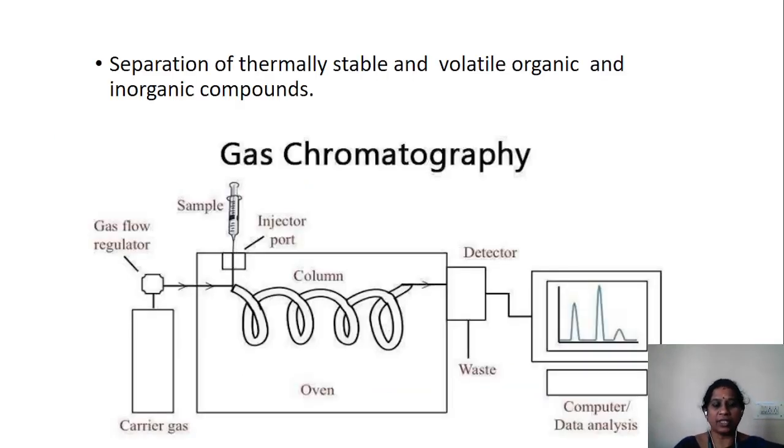So, gas chromatography is a separation of thermally stable and volatile organic and inorganic compounds. And the below diagram shows the various elements of a gas chromatograph.